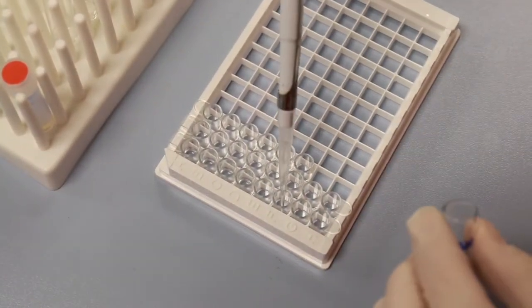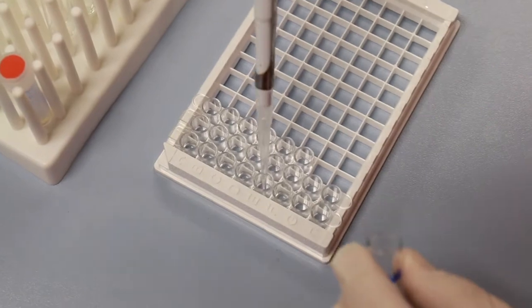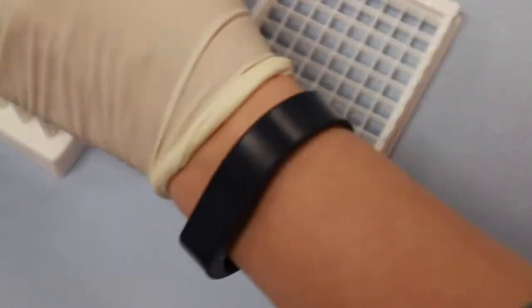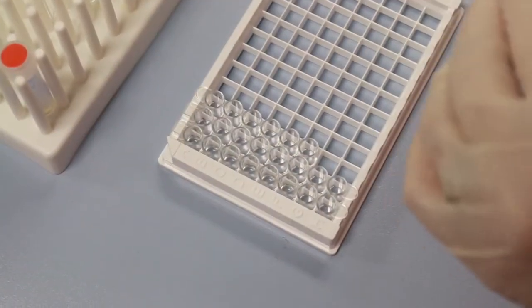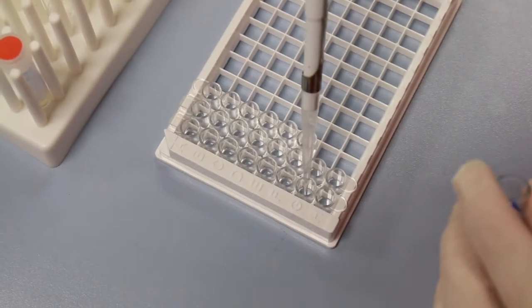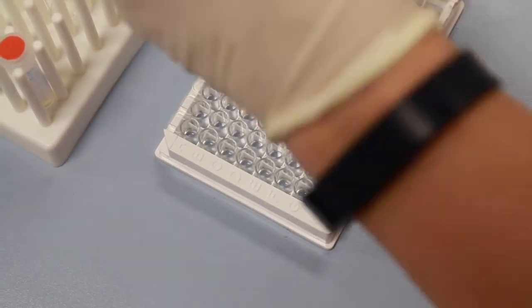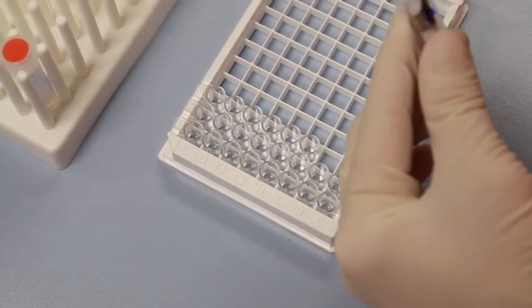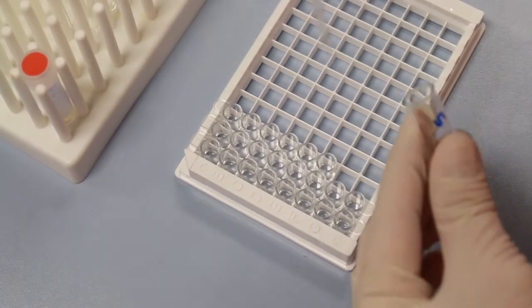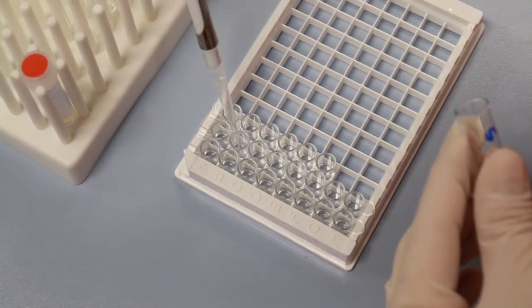This is especially important if you are using a plate washer that washes a complete 8-well strip at a time. If you have a 12-tip multi-channel pipette, simply remove 4 tips to allow you to pipette down each column easily.